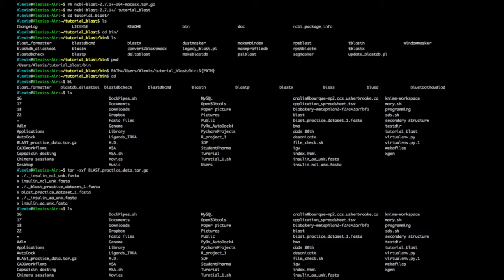The purpose of this exercise is to determine from which species these two unknown insulin sequences come from. I chose insulin because it's very short, so even on an old computer, as long as you can download the data, you should have no problem running it — it's not computationally expensive.